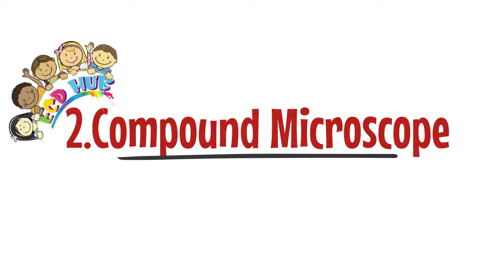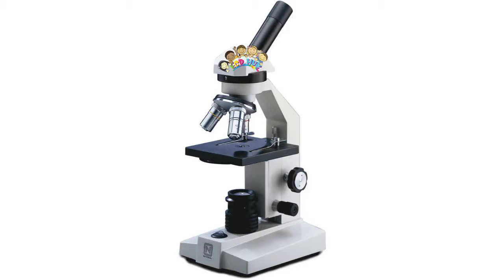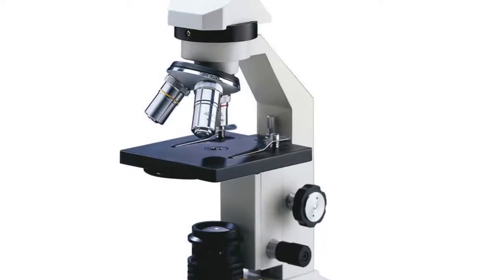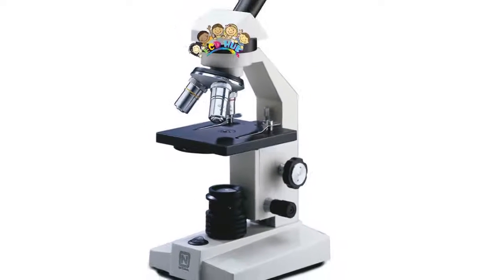The second is the compound microscope. With 2 lenses, the compound microscope offers better magnification than a simple microscope. The second lens magnifies the image of the first.